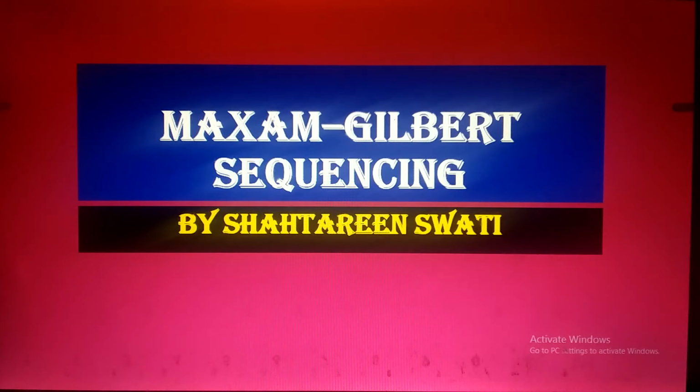And I'm here to deliver the lecture on DNA sequencing. Today I'm going to discuss the Maxam-Gilbert sequencing. I have discussed in detail, in the biotechnology series, the basic principle of sequencing, the Sanger method and cloning. So you must watch all these lectures, so this lecture will be easily understandable for you.